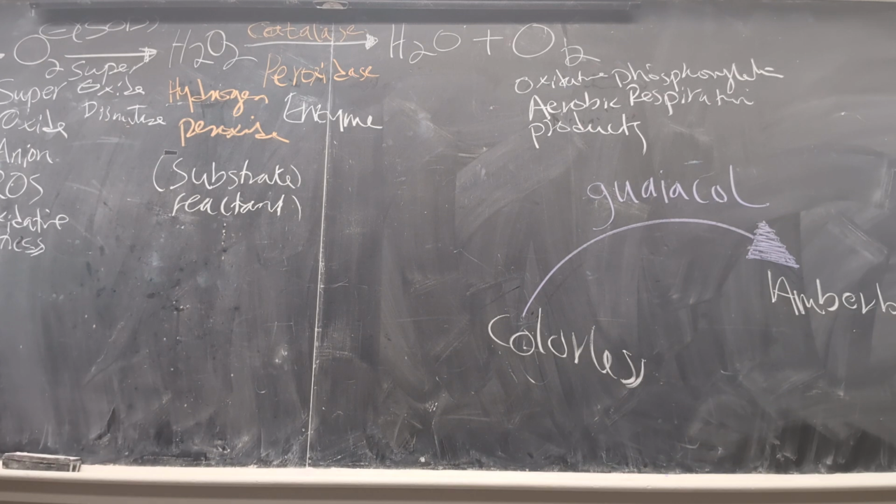Okay, all right. So now I'm going to put in my enzyme. What do I expect? Wait, Professor, it's already changed, because there's a little bit in there from before. Okay. Let me use a better one. You canceled my whole experiment.